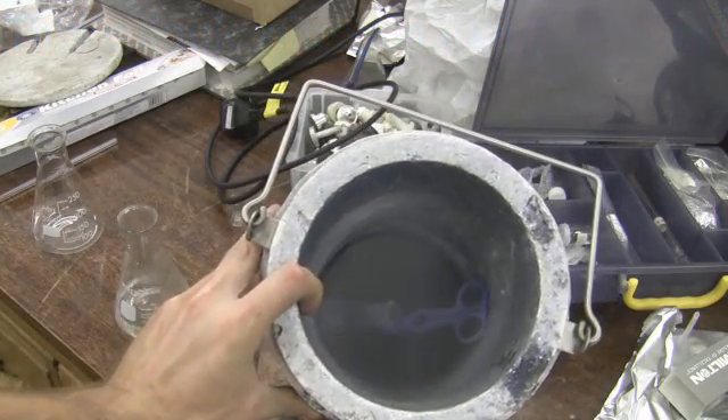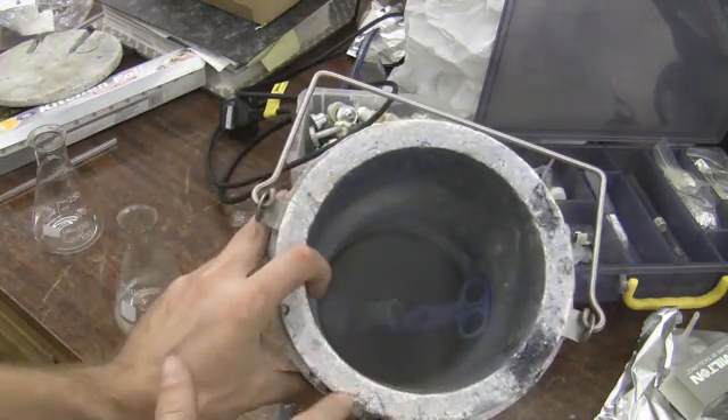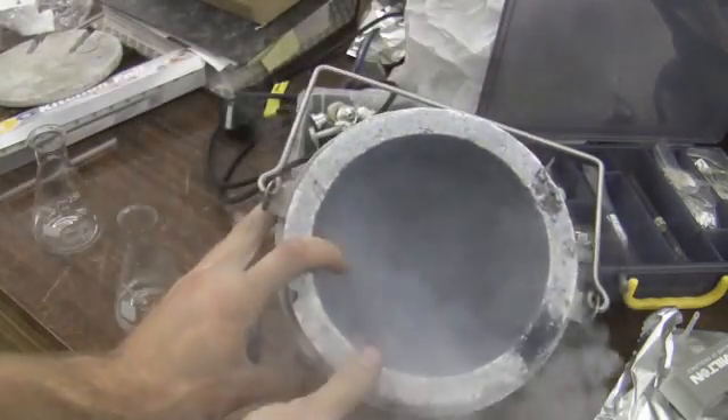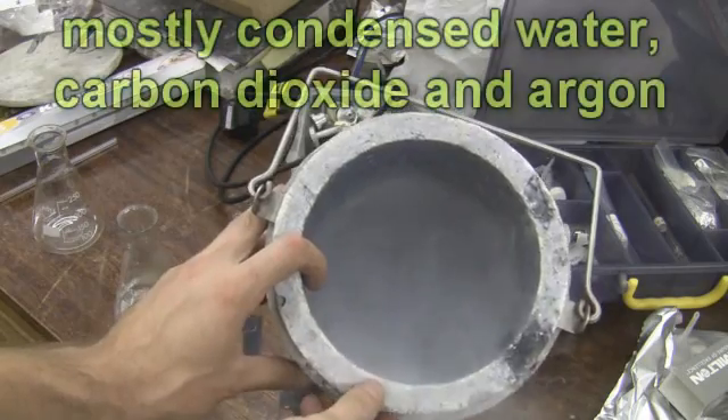Because I've been really still, everything that was condensed in there has now sunk to the bottom. However, if I blow in there you'll see what I mean. This is what you usually get over liquid nitrogen.